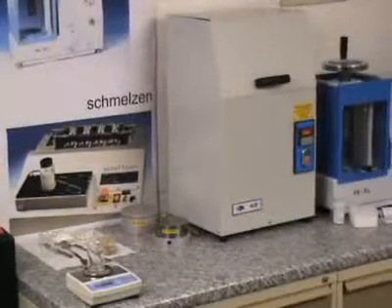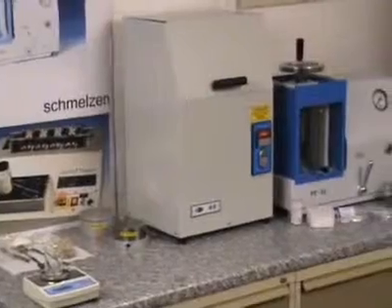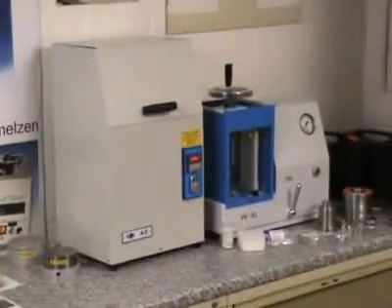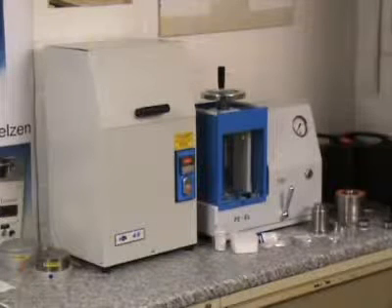This demonstration video shows sample preparation for XRF for making pressed pellets. You see the HK40 desktop swing mill on the left and the electro-hydraulic laboratory press PEEL on the right.